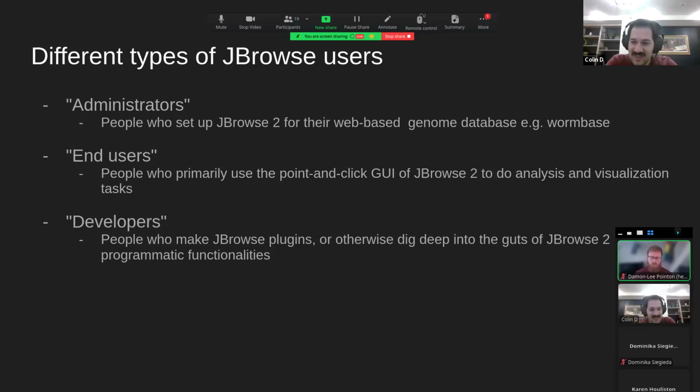this distinction, I think, comes out very clearly when you have to write documentation, because it's sort of like, how do you onboard someone into this system? You have to have these different entry points to help explain it to people. And that's complicated. But I think by creating that distinction, you can get at the best way to explain it.